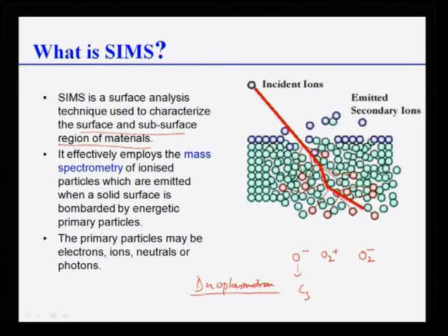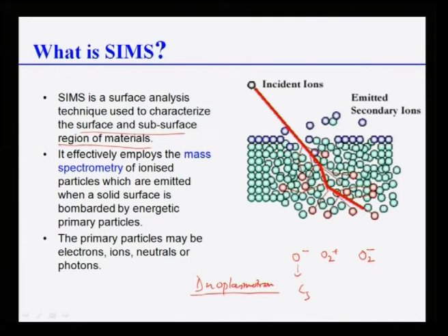And the second type of SIMS uses something known as cesium ions. It is used to enhance the yield of electronegative elements like carbon, oxygen, or even sulfur, because they are very low atomic mass elements. We use cesium guns, which operate in the positive mode to create Cs plus ions. Generally, Cs beams are smaller. The duoplasmatron creates oxygen ions mostly, and you can create others, but the Cs guns are much finer.